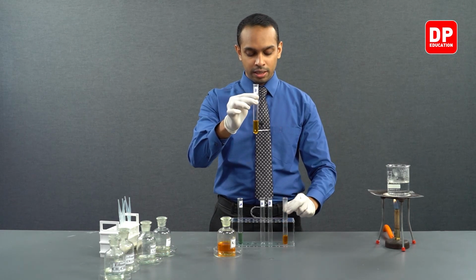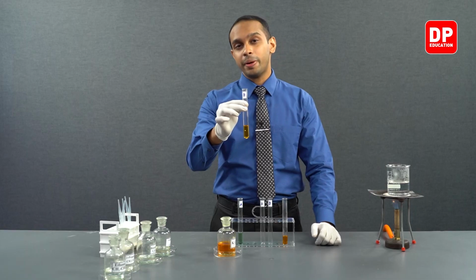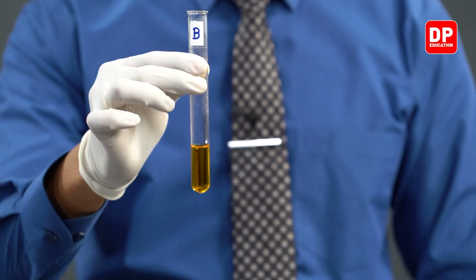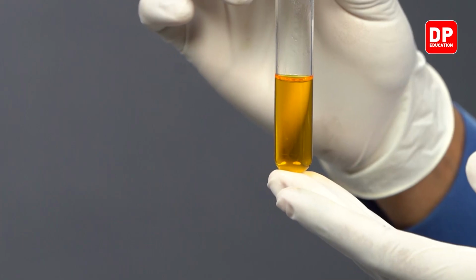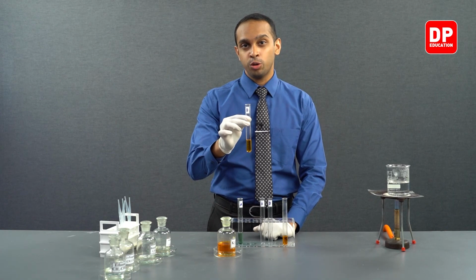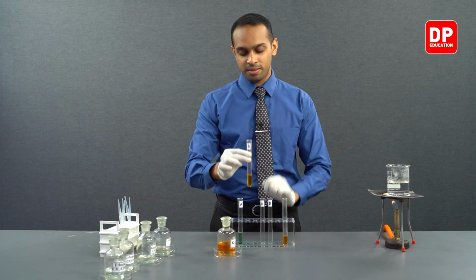So let's put aside the control and focus on our acetone containing test tube. In the presence of acidified potassium dichromate, acetone did not have any reaction. That is why the color of the potassium dichromate persisted. So this is an indication that aliphatic ketones do not react with acidified potassium dichromate. There is no observation when you are reacting acidified potassium dichromate with aliphatic ketones.